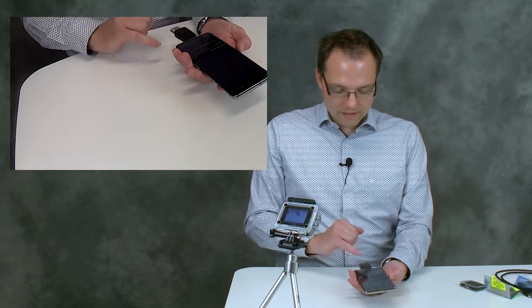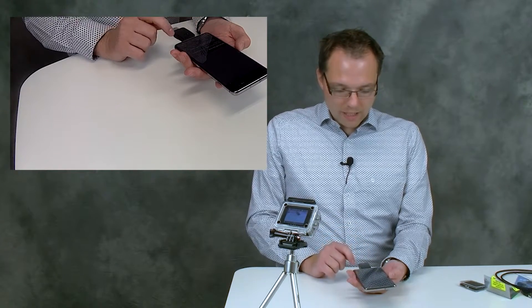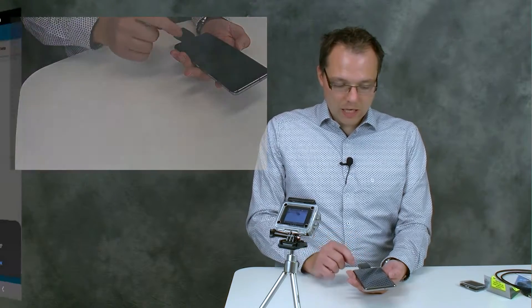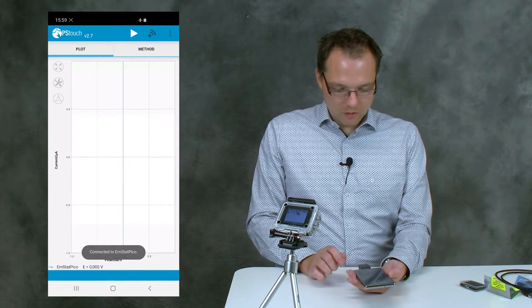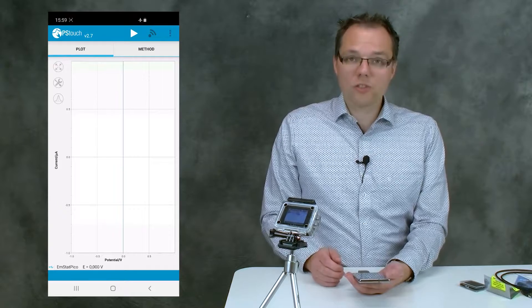That means that it is powered and working as expected. Now the phone will ask you for permission to use the device. You just press OK, and then you see that it's connected by the little message that pops up.